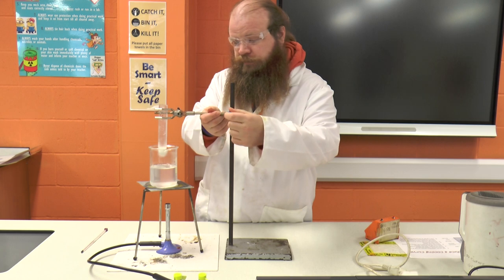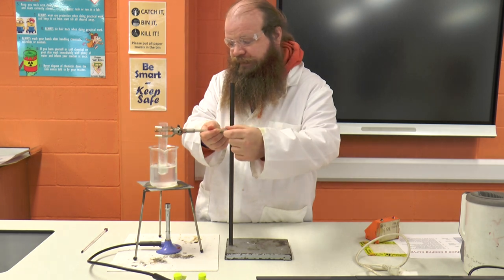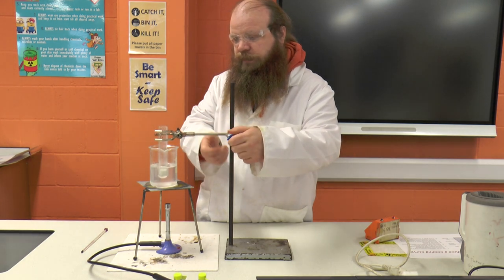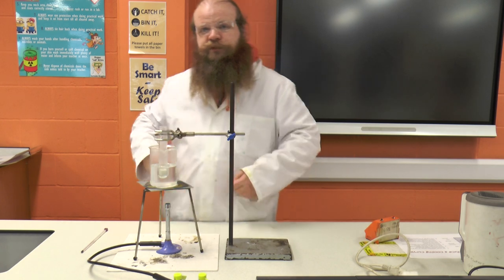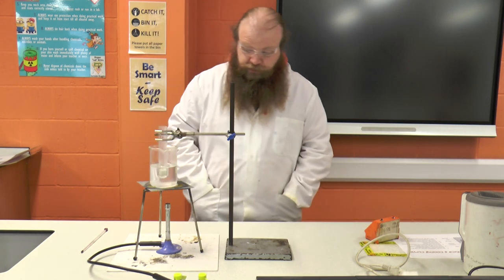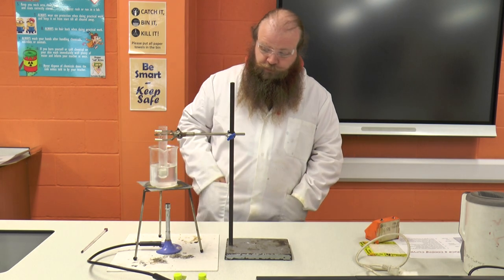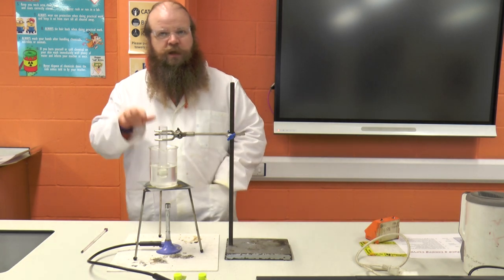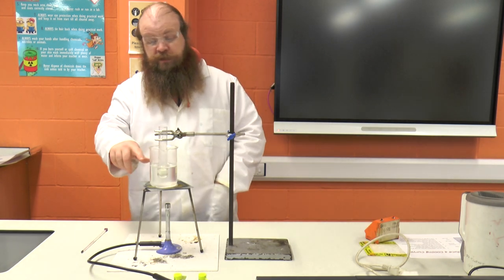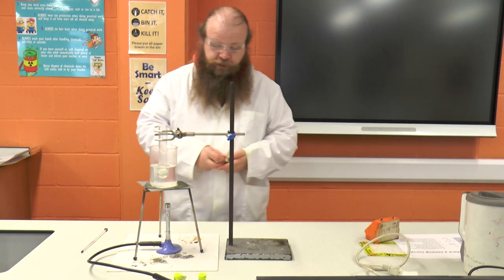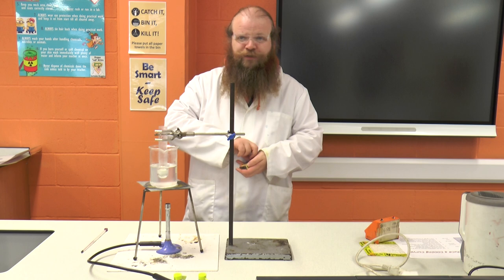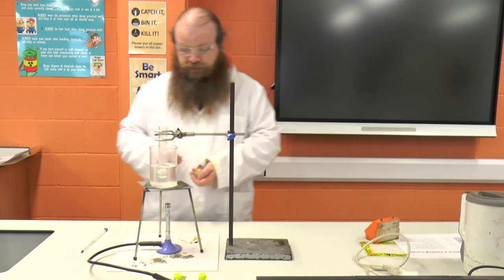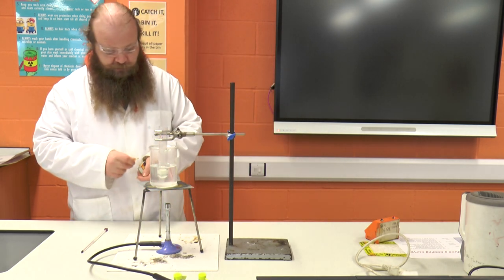We're going to put the stearic acid down into the boiling water and we're going to hold it there using a clamp and stand. It's important that the level of the stearic acid is below the water line of the boiling water in the beaker, but the boiling tube is not touching the bottom of the beaker as that can cause the beaker to crack.